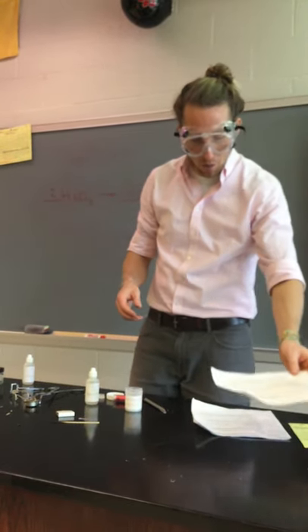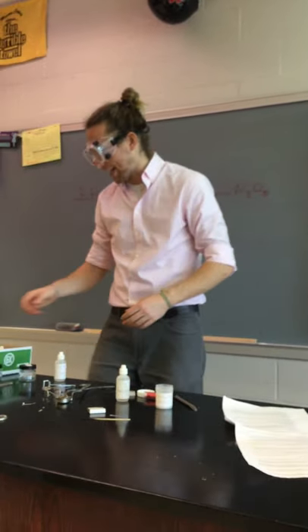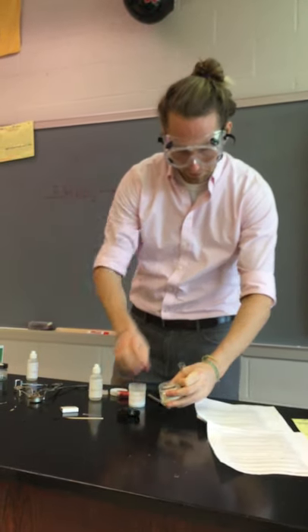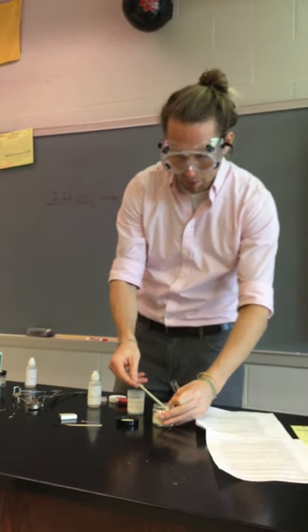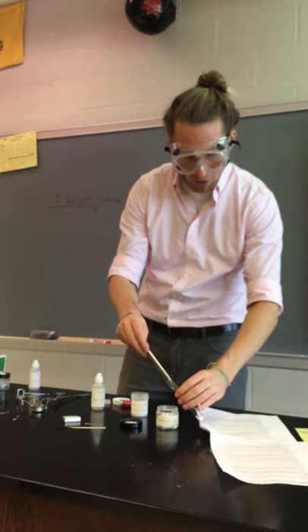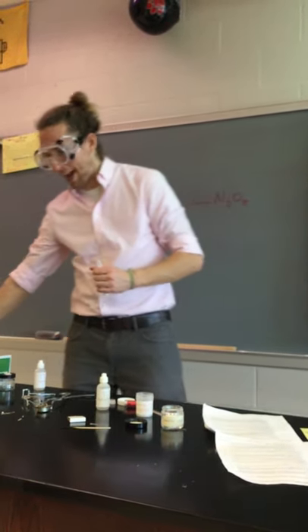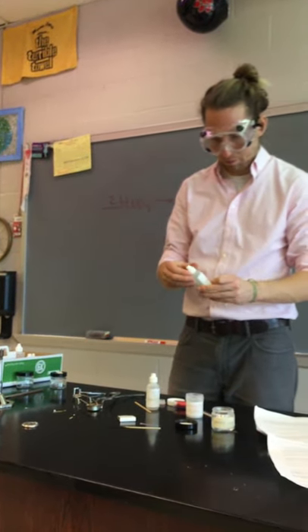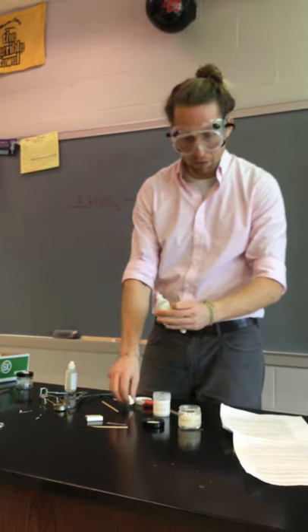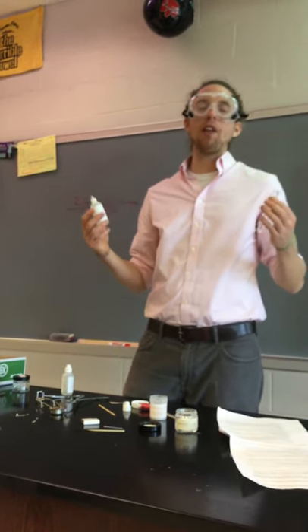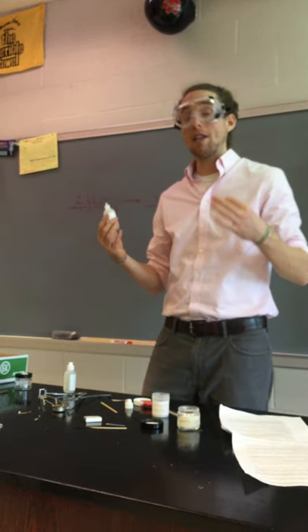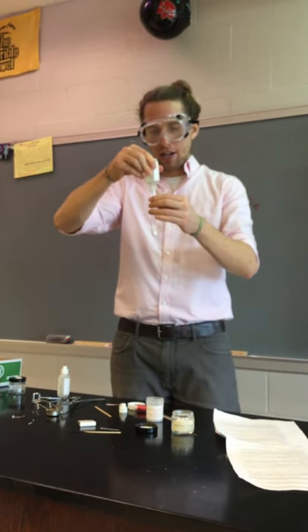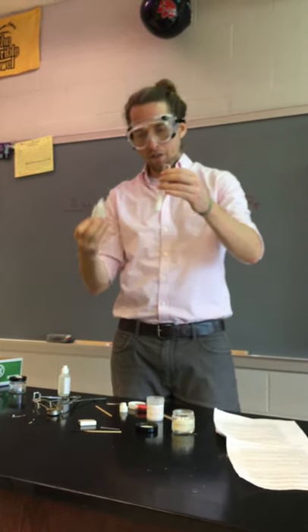Reaction number four. We are going to put calcium carbonate in a different test tube. So calcium carbonate, again, kind of a white solid. And this time we are going to add hydrochloric acid to the calcium carbonate. And again, we're going to have a wooden splint at the ready to ignite. So my hydrochloric acid is right here. We're going to put in about 20 drops. You'll notice that we're not really counting that specifically. We don't care so much about quantitative results for this lab, we care more about qualitative results.